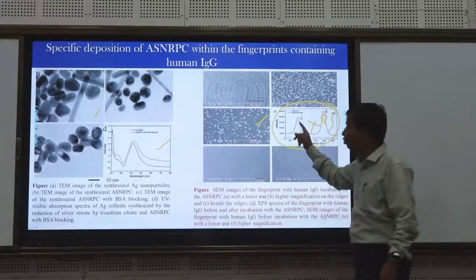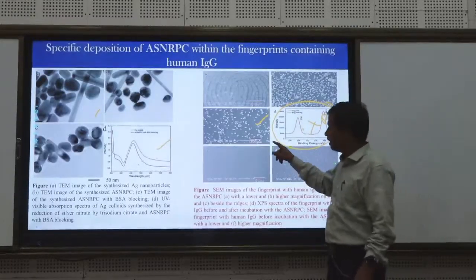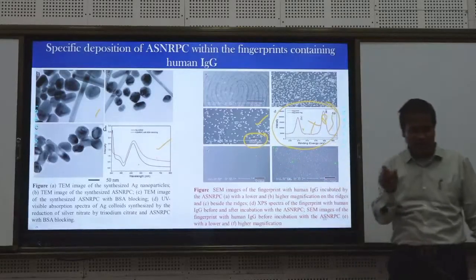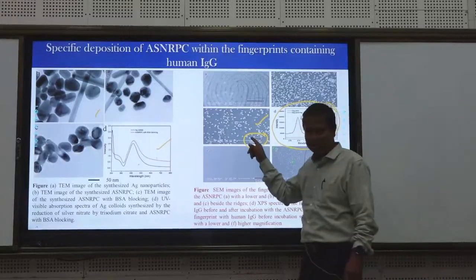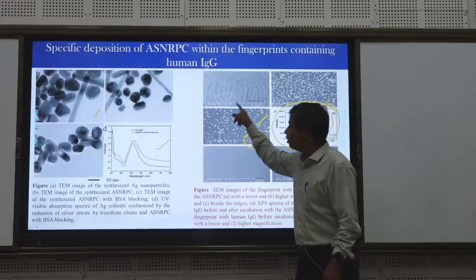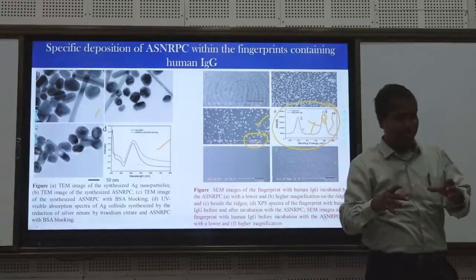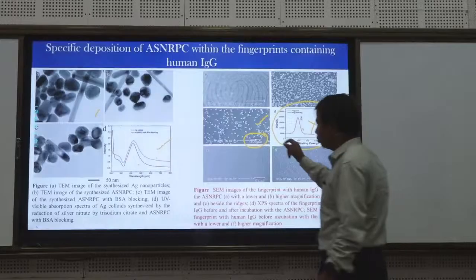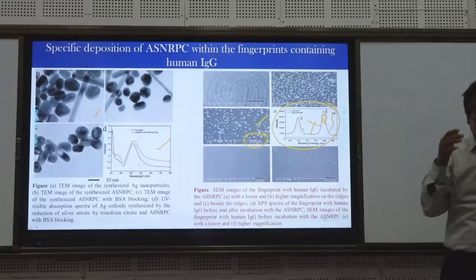Again spectroscopy is there. Again spectroscopy. Again image. So everything is there. Whenever you see an image, you must see this one. This is the bar. This is the length. What does it mean? Since you people are students, this will be more important for you. It is an electron beam scattering image. So through that you can see even nanometer scale.